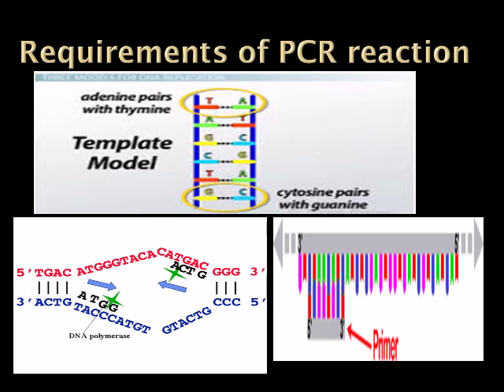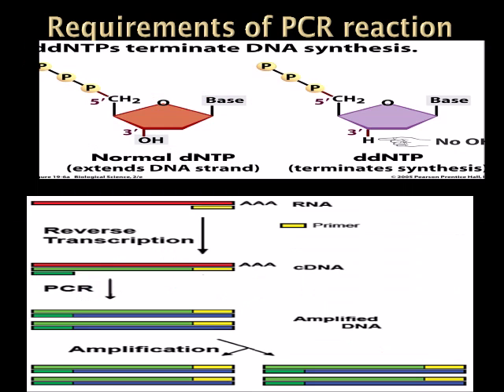The PCR reaction requires the following components. First, DNA template, which is the genetic code to be copied. Second, the DNA polymerase enzyme that synthesizes new strands of DNA complementary to the target sequence. The first and most commonly used of these enzymes is the Taq DNA polymerase. Third, the primers. They are short pieces of single-stranded DNA from which the polymerase begins synthesizing new DNA. It also needs the deoxynucleotide triphosphates, which are single units of the bases of DNA and act as building blocks. And finally, reverse transcription PCR, in which the conversion of sample RNA into complementary DNA occurs.